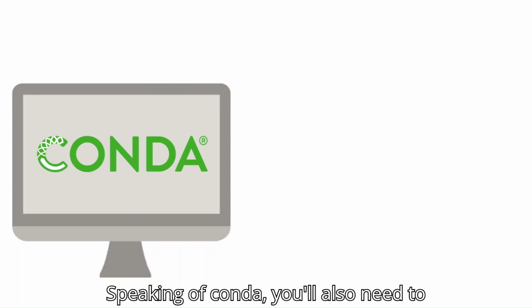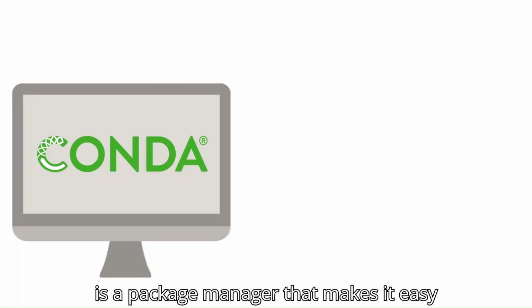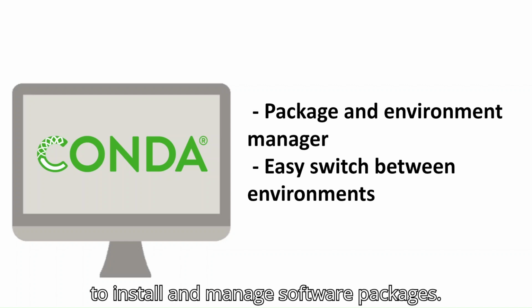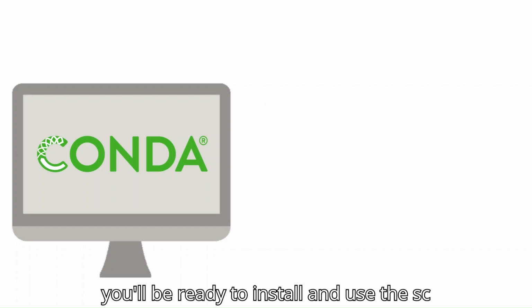on your system. Speaking of Conda, you'll also need to have it installed on your system. Conda is a package manager that makes it easy to install and manage software packages. Once you have Jupyter and Conda set up, you'll be ready to install and use the SC toolbox.